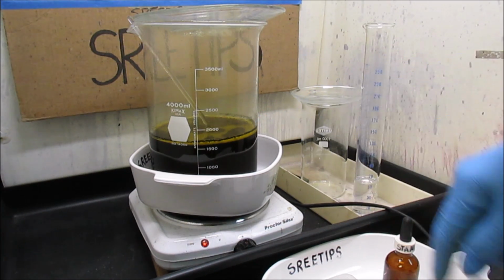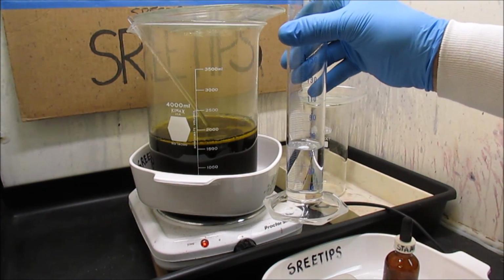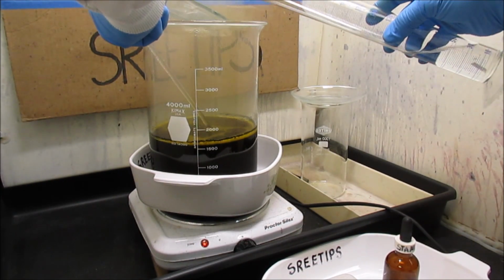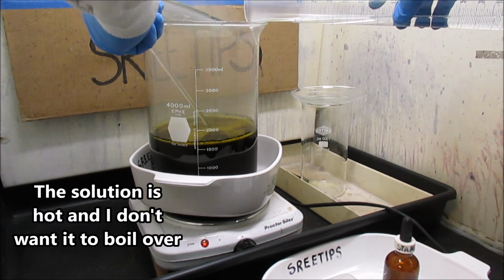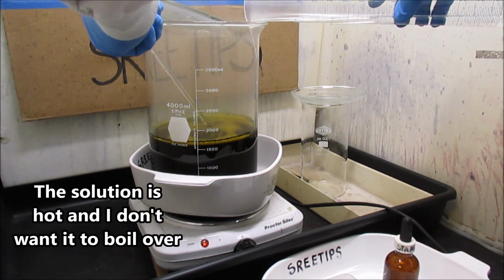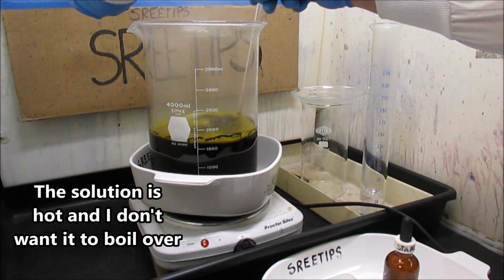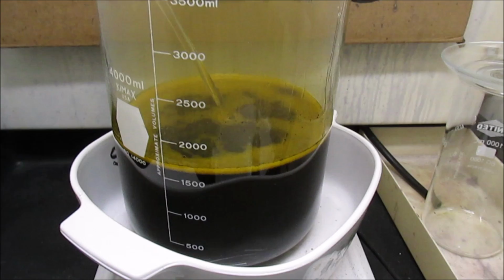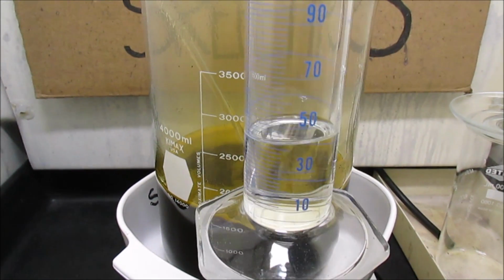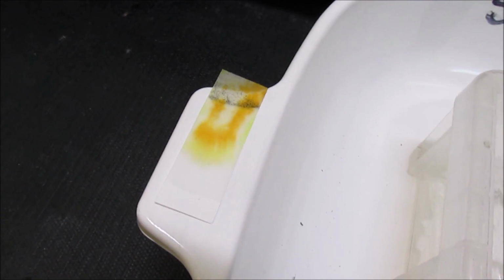This has been on about medium heat now for about an hour and a half. I'm going to go ahead and add the rest of the concentrated nitric acid here. There's about 60 ml left. Don't want to boil the solution over. Still got about 40 ml of concentrated nitric left to go in. And just to show you, that's what the stannous chloride test is looking like.